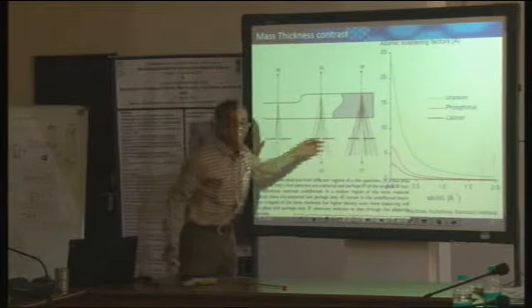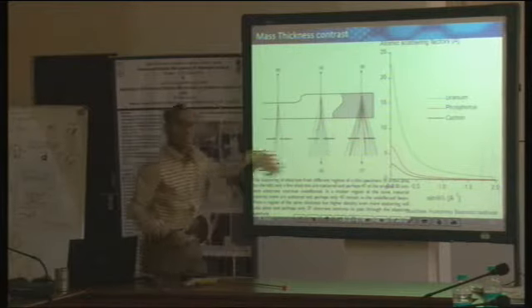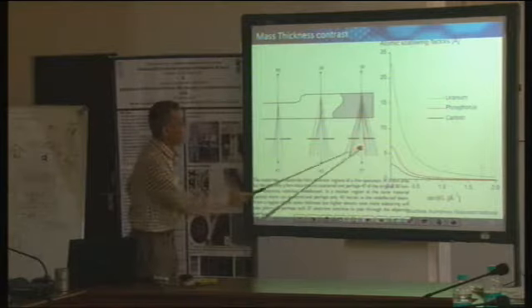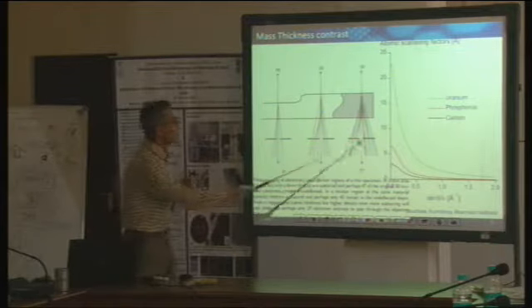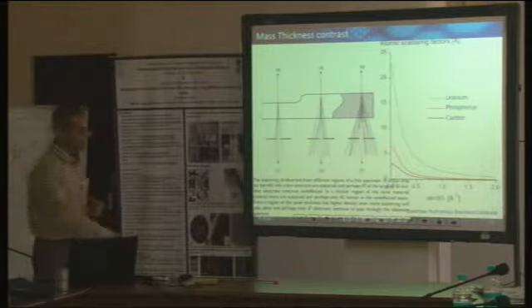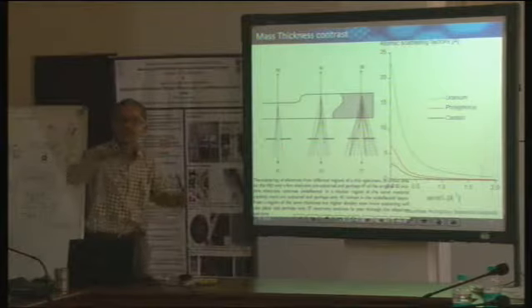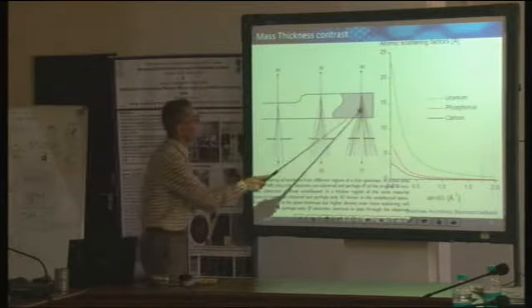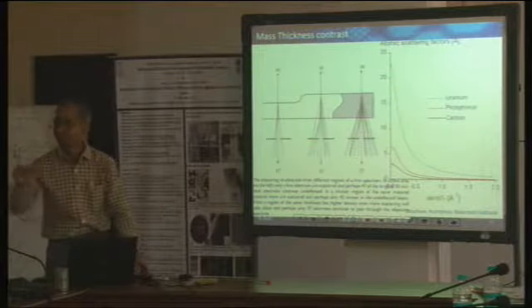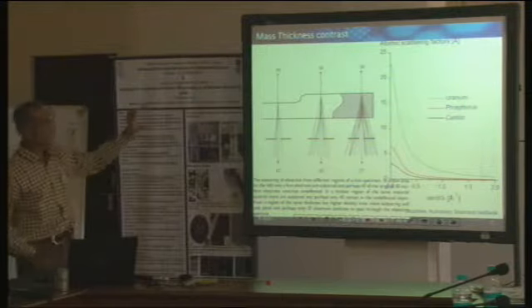And because of the scattering which I explained, how is this point going to look in the bright field image? Please tell me, when I make an image of this sample by the technique we just discussed, how is this area going to look? Will it have more intensity or less intensity? Less intensity. So you have understood. That's all about mass thickness contrast.